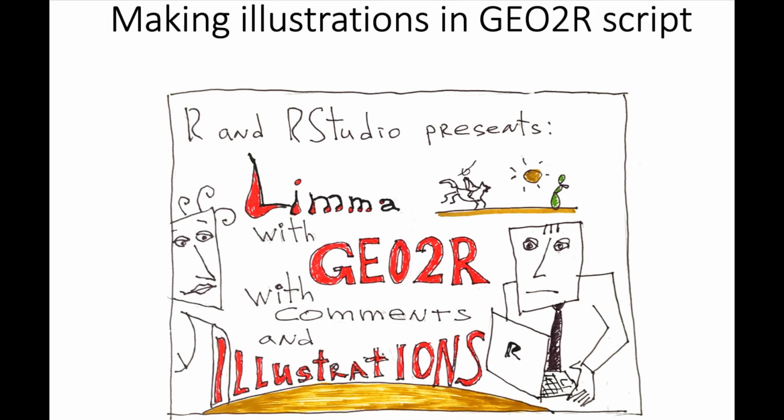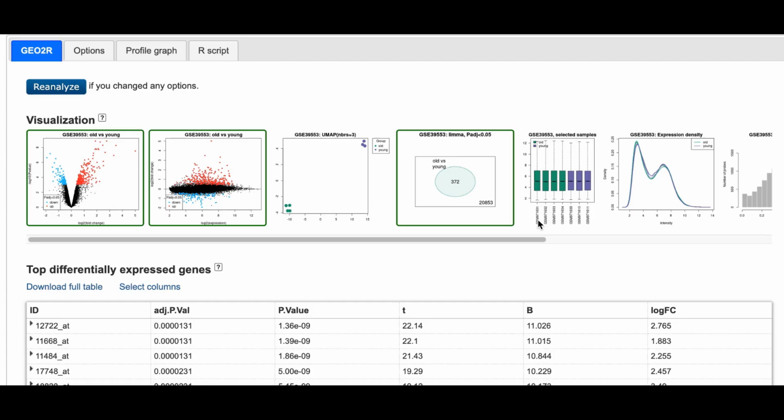The last part of the business with the expression microarray script is to put all illustrations in the right order. When you run GEO2R online, the results and the figures appear at the end all at one time, and therefore you do not learn whether those figures are really necessary or helpful for the understanding of the order of events in your script.